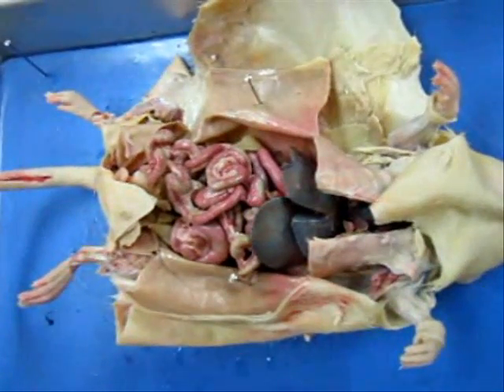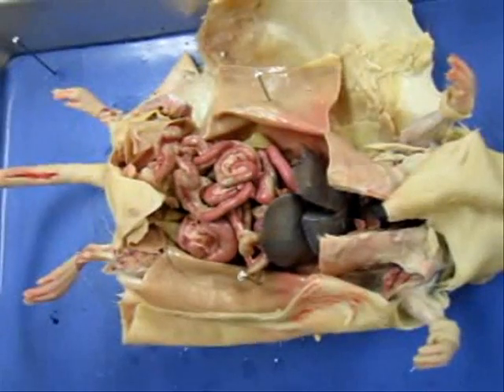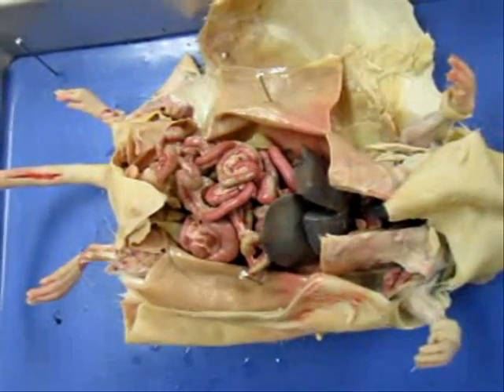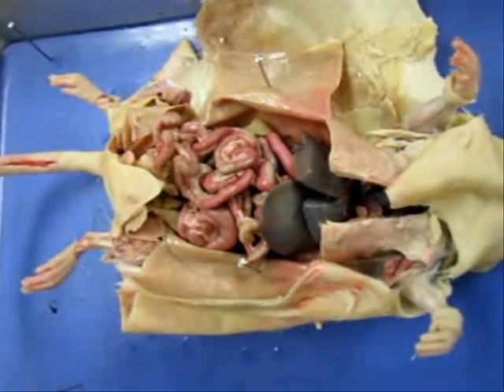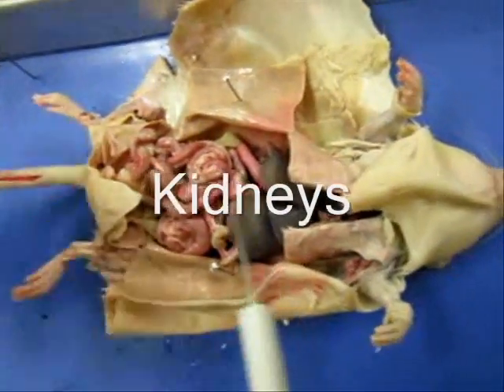The liver has many functions. It produces bile, which aids in digesting fat, and also stores glycogen and transforms waste into less harmful substances. Rats' livers are different in comparison to the human body because rats have more than 2. Most rats have 6.